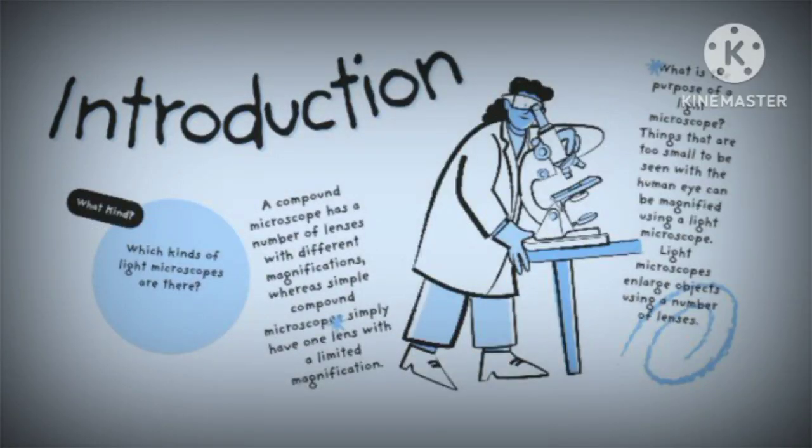To begin with, I would like to ask: what kinds of microscopes are there? A compound microscope has a number of lenses with different magnifications, whereas a simple microscope has just one lens with a limited magnification. So, what is the purpose of the light microscope? Things that are too small to be seen with the human eye can be magnified using a light microscope. A light microscope enlarges objects using a number of lenses.